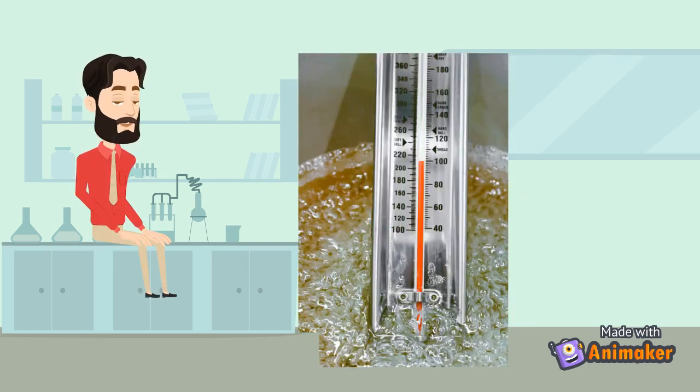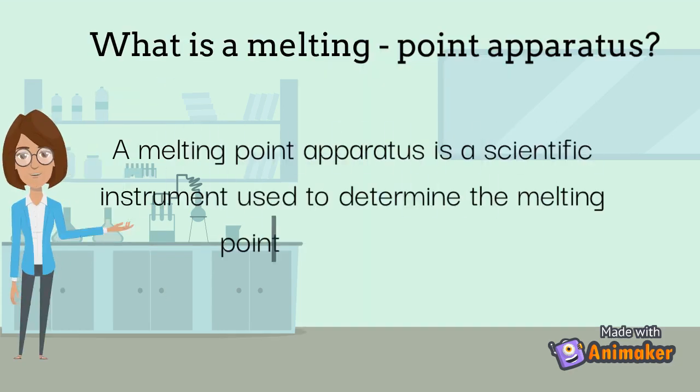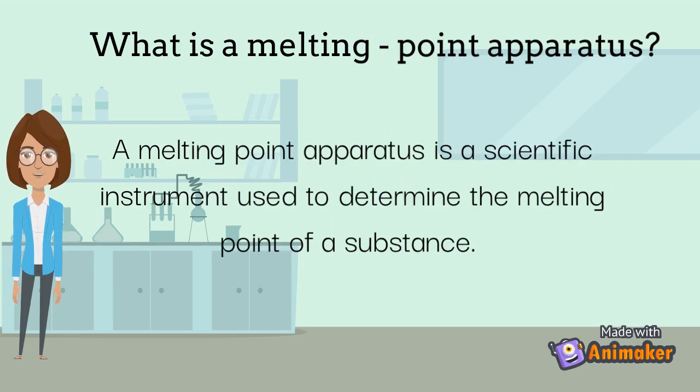In our findings we used a melting point apparatus. It is a scientific instrument to determine the melting point of a substance.